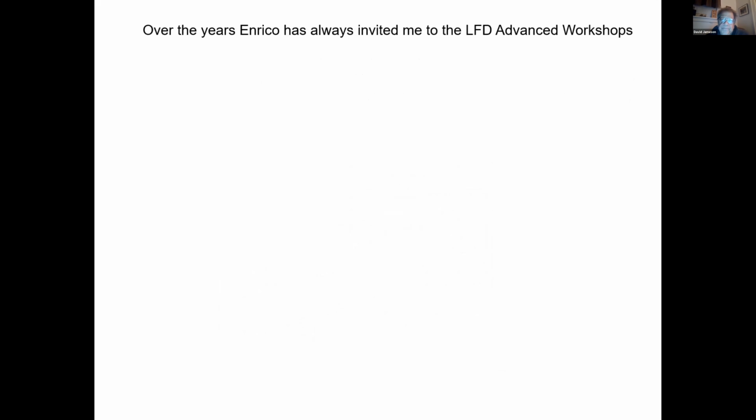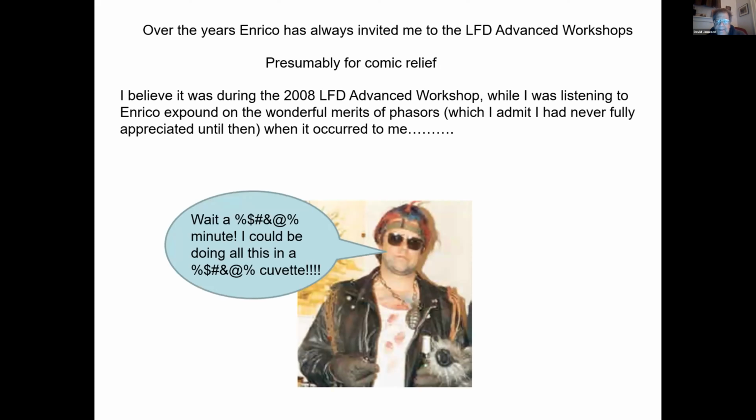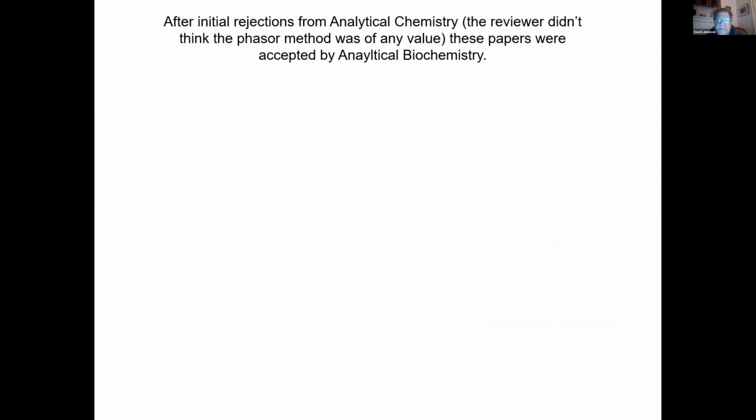Now, over the years, Enrico always invited me to the LFD advanced workshops. I presume for comic relief. But I think it was during the 2008 workshop, I was listening to Enrico expound on the wonderful merits of phasors, which I admit I didn't really appreciate until then, when it occurred to me, wait just a damn minute, I could be doing all of this in a cuvette. You can see me right after I got tenure. In fact, that happy thought kicked off a series of cuvette-based phasor measurements.